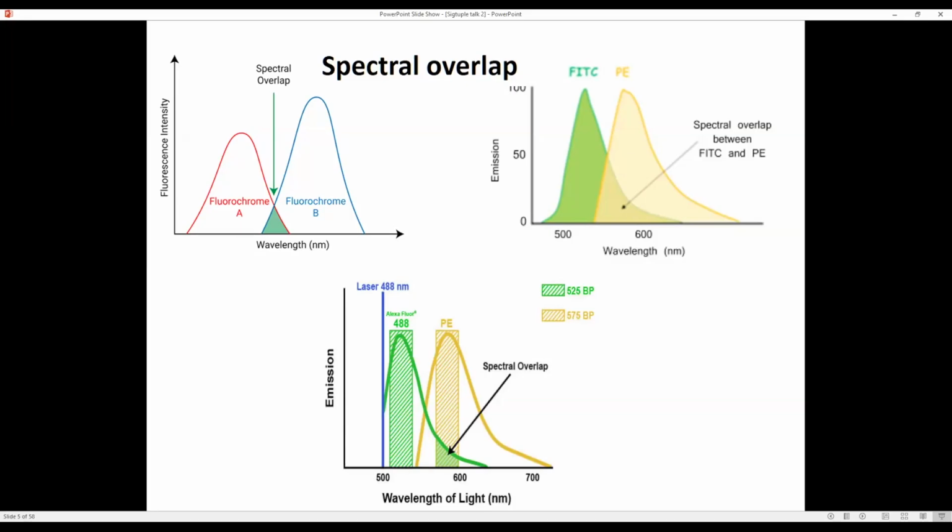See, the fluorochrome is like a tracer molecule. It is like a label. You can tag it with any antibody, irrespective. For example, anti-CD3, anti-CD19, anti-CD20 has nothing to do with emission spectrum. Emission spectrum is fully a property of the fluorochrome. And when you talk about spectral overlap, you are talking about multiple fluorochromes, minimum two to maximum any number, based on the numbers you use. I suppose that is answered, right?